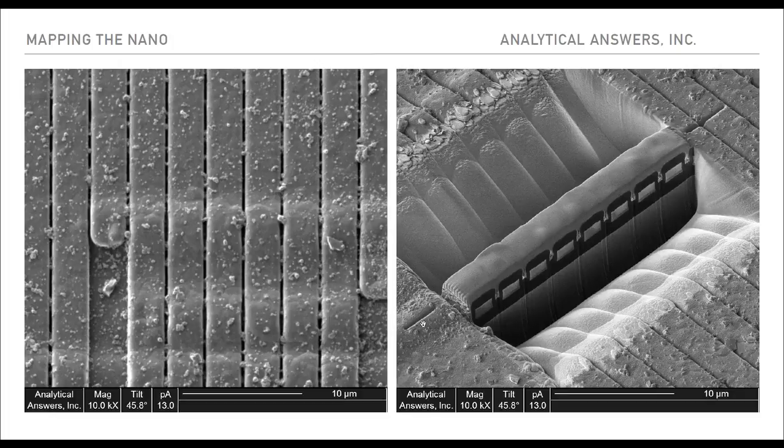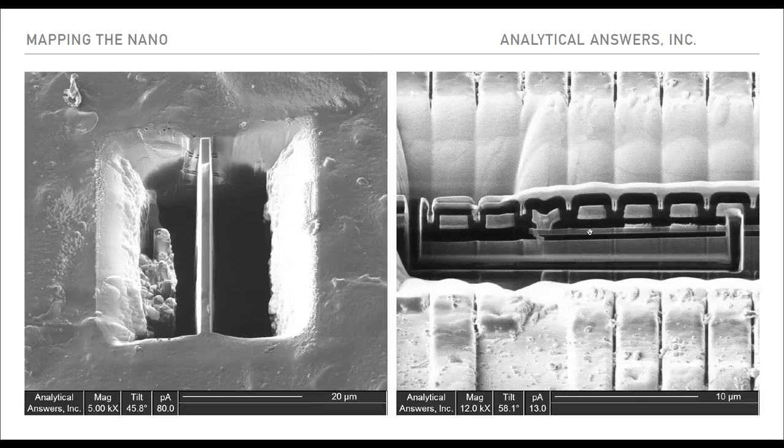That's the picture from before. There's some fiducial marks that we burned in on the left and the right of the cross-section to mark the location of that contact, so that when we start cutting, we make sure that we hit the feature of interest. Again, it's a fraction of a micron.